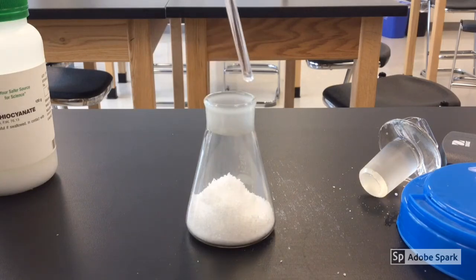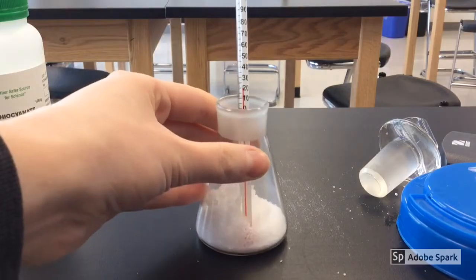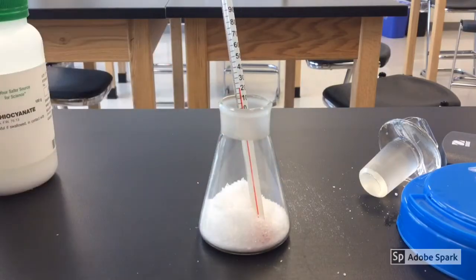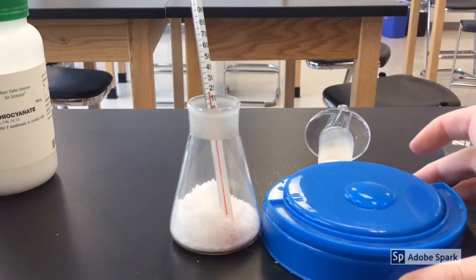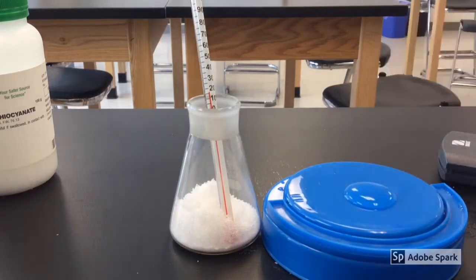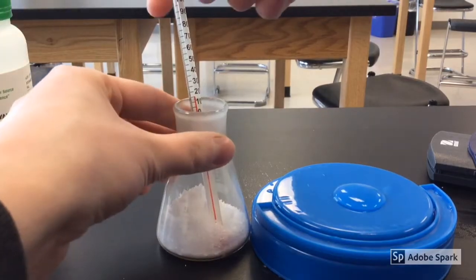Before I go ahead and mix it, I'm going to place a thermometer in there so you can see the temperature. Right now it's currently at about 20 degrees Celsius, so that's about room temperature. I also have this little cap here — I put some water on it, and you'll see why I did that in just a moment.